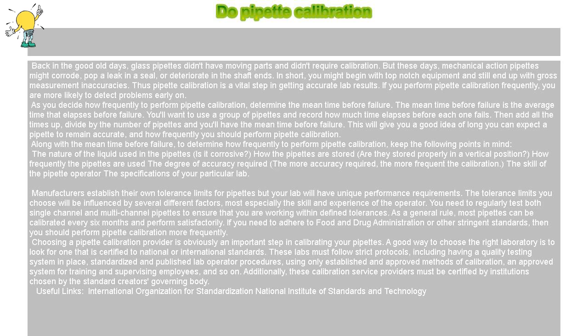Additionally, these calibration service providers must be certified by institutions chosen by the standard creators governing body.